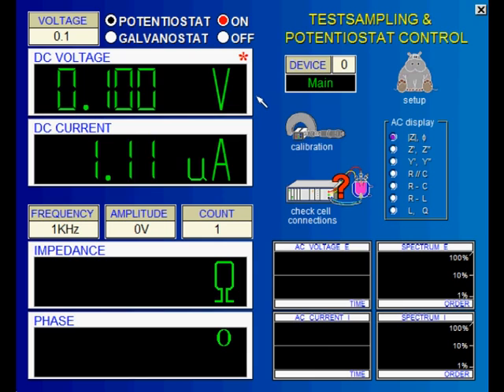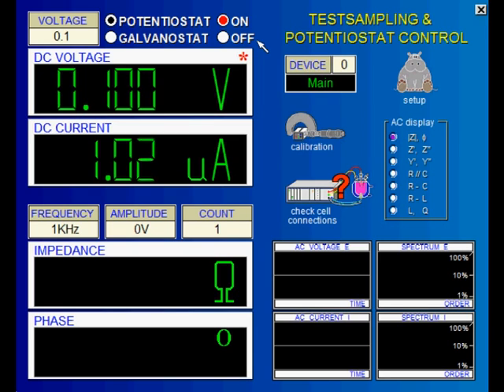We haven't switched on the potentiostat so far — let's do it now by clicking here. You can see the potential and current values displayed by the software instruments. Please keep in mind that the current limits set in the setup page are not valid in the control potentiostat mode; here the entire current range of the device is used. The current limits are only used in the measurement modes.